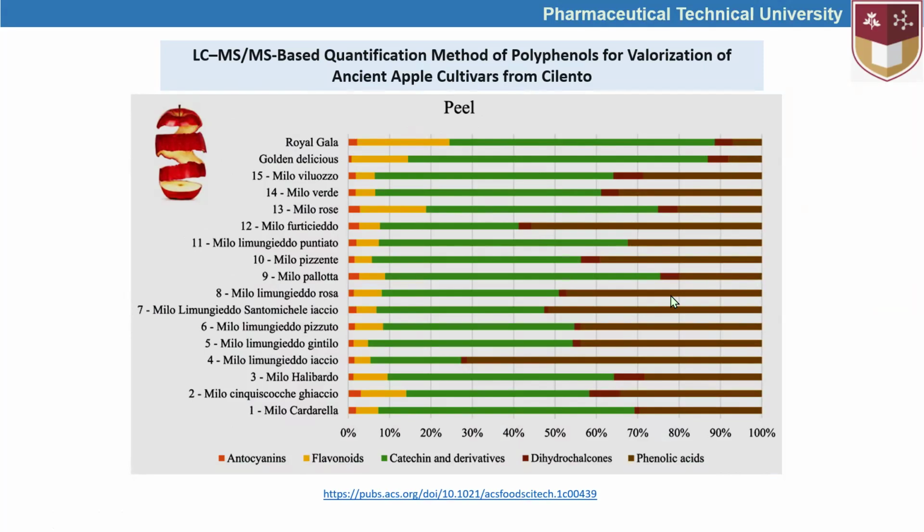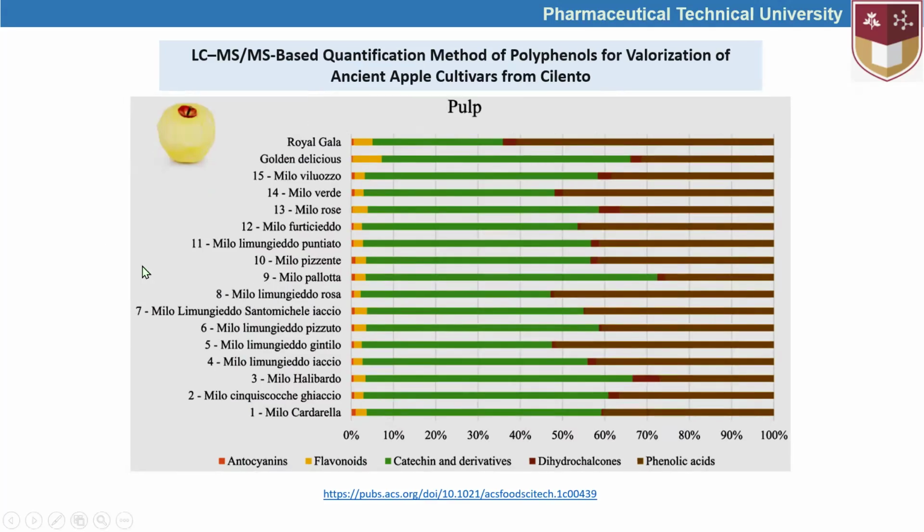I hope you can differ them from each other. Different varieties of apple were taken in this study, and their peels and fruits, pulp, were studied and compared.